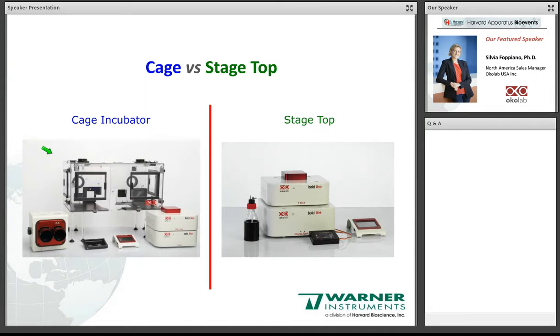Now, other manufacturers call it maybe wraparound or box system, but it's easily identifiable by the presence of this transparent enclosure. You have a number of controllers for temperature and CO2, but you will always see this large enclosure. A stagetop, however, is much more compact. It has only a small chamber and similar controllers.